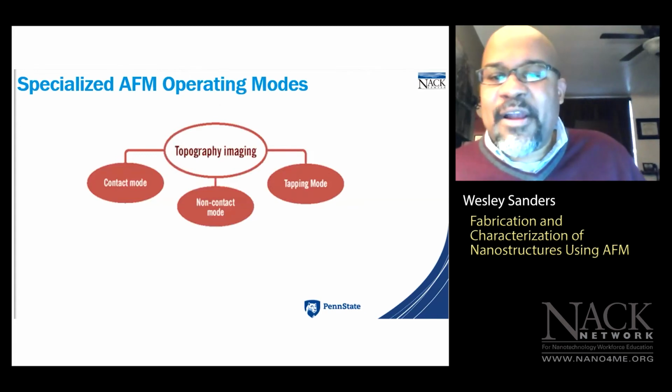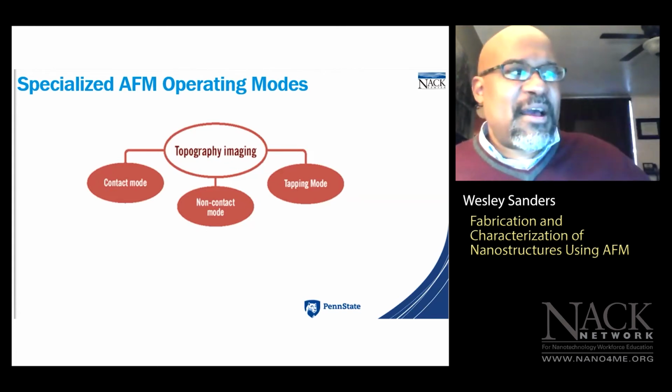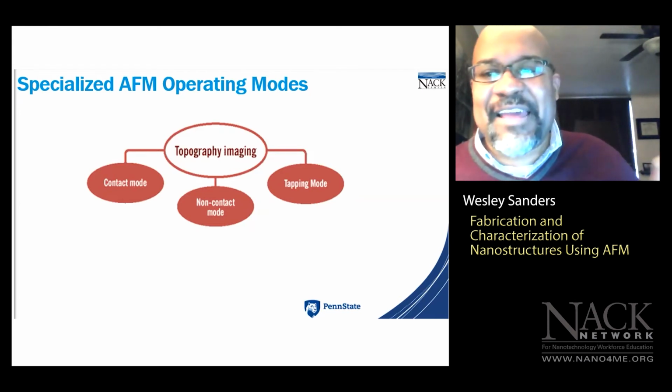So before I talk about the last imaging technique that we use to see the nanostructures printed using AFM, does anybody have any questions regarding LFM, also known as frictional force microscopy?